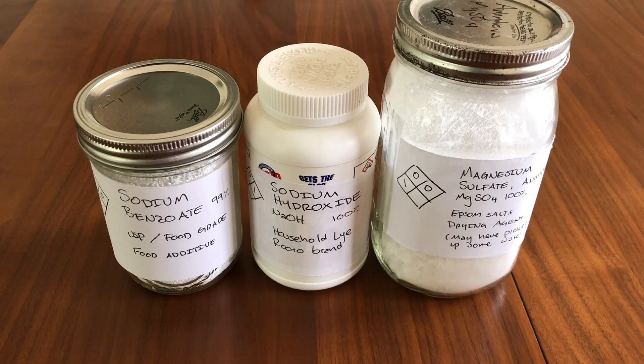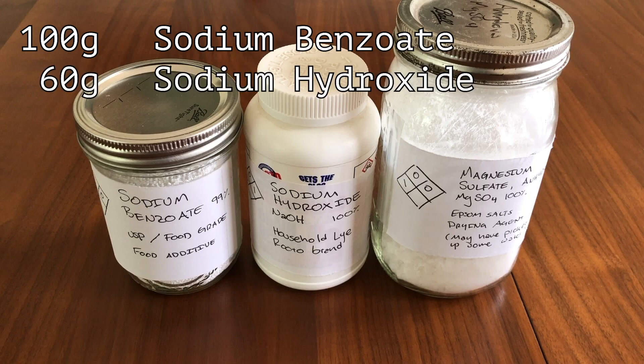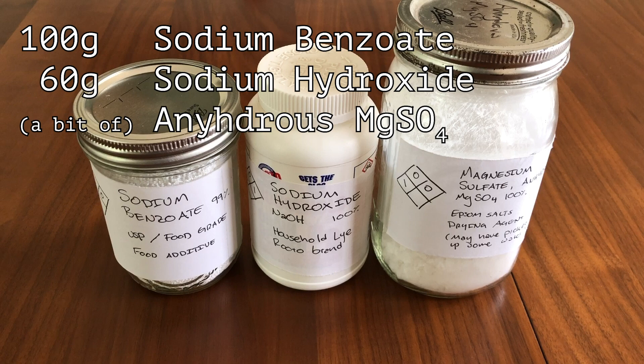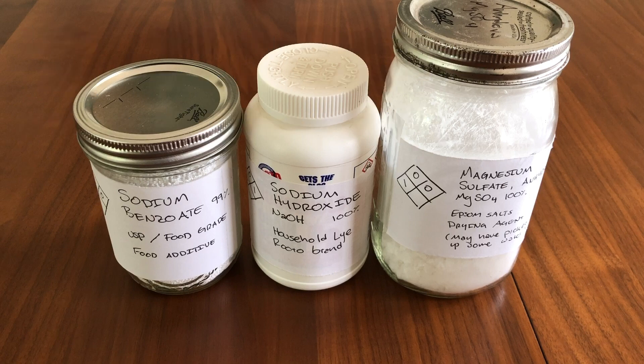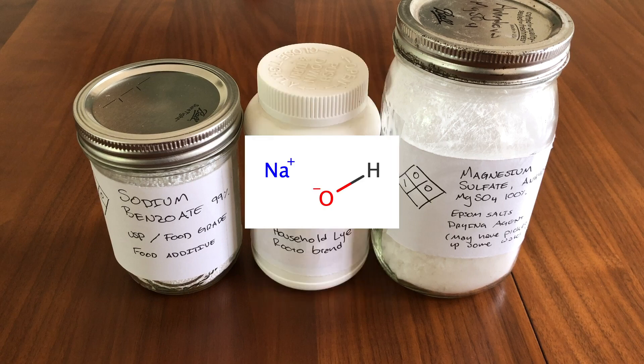For this reaction, we will need 100 grams of sodium benzoate, 60 grams of sodium hydroxide, and a bit of anhydrous magnesium sulfate. These are all simple to get. The sodium benzoate is a common food additive and I got mine on Amazon. Sodium hydroxide is a drain cleaner and I purchased it at the hardware store.